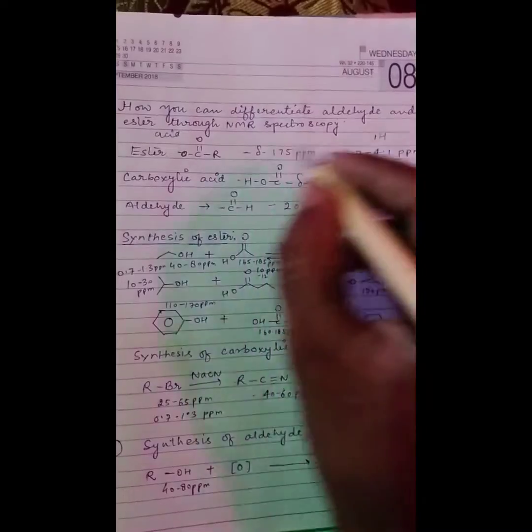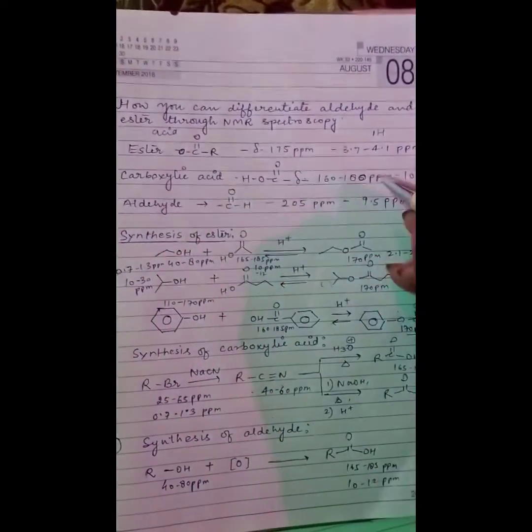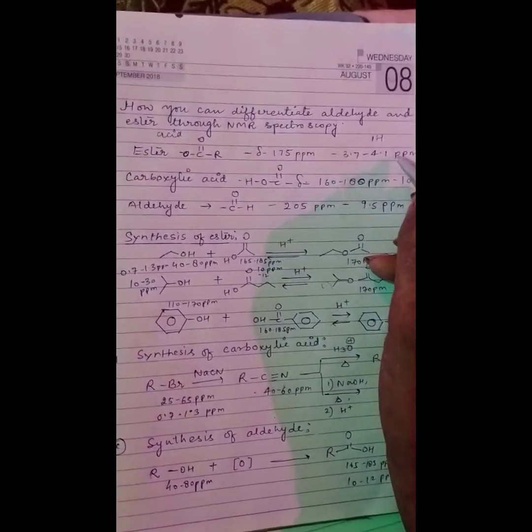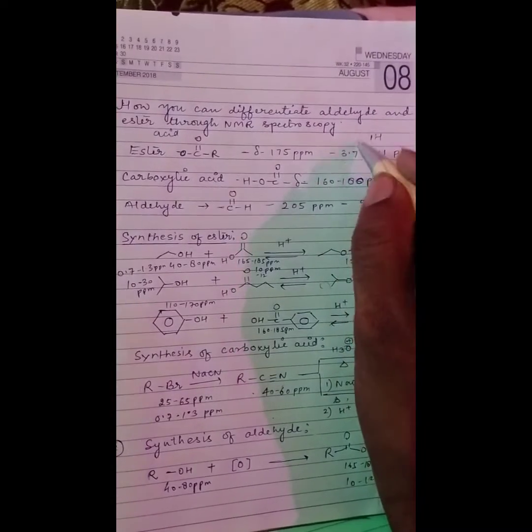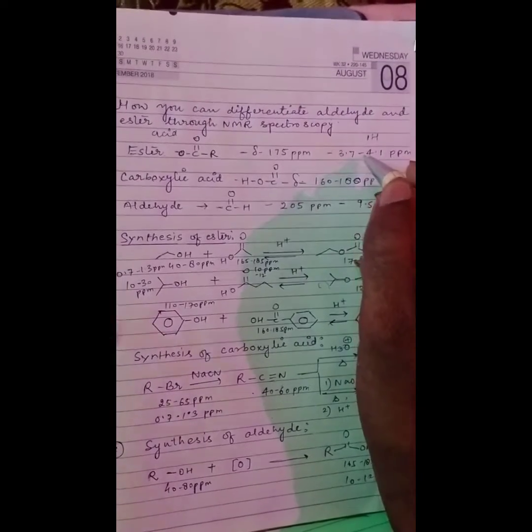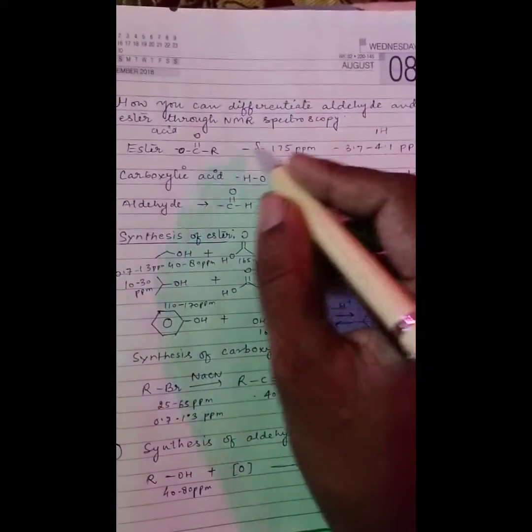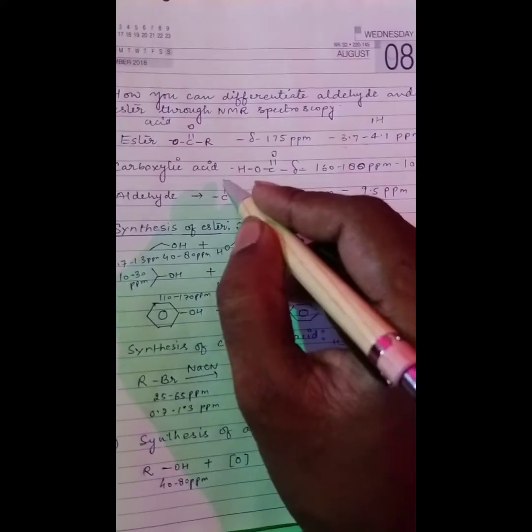First of all, you should know the proton NMR. For the OCH3 of the ester, the signal will appear at 3.7 to 4.1 ppm. If a splitting pattern occurs in this region, then you should know that the ester is present in this compound. In C13 the delta value is 175. So these two values determine the functionality of the ester.